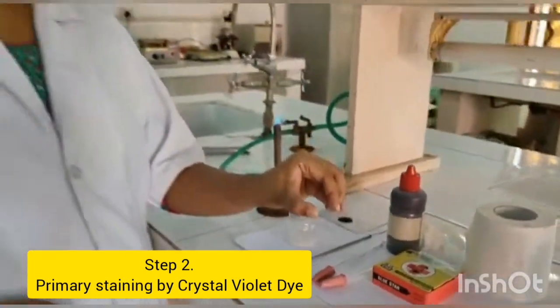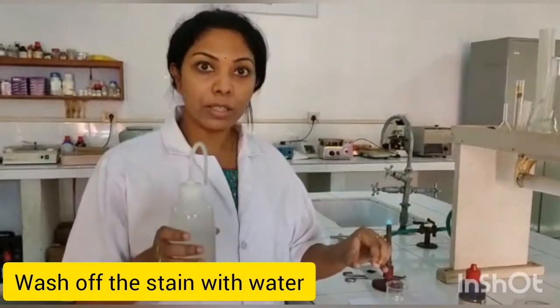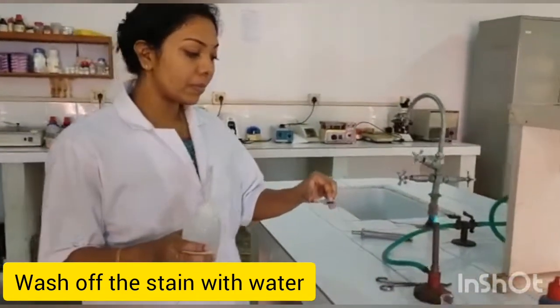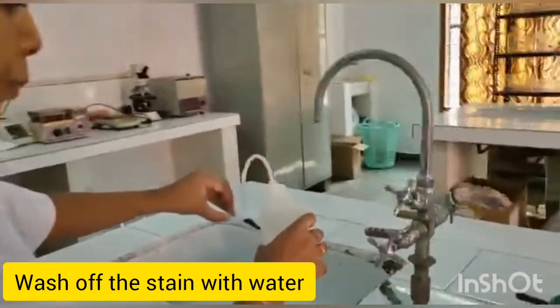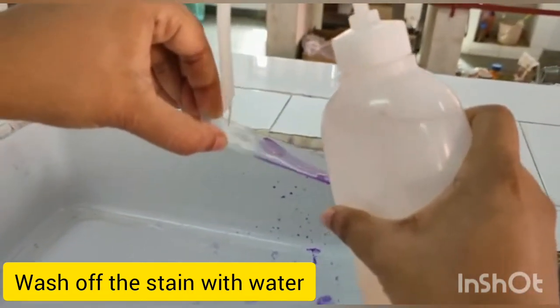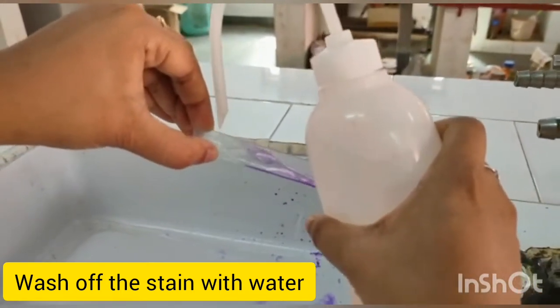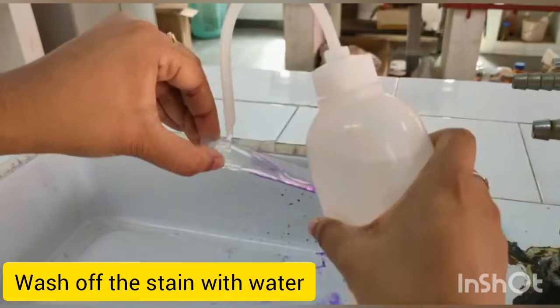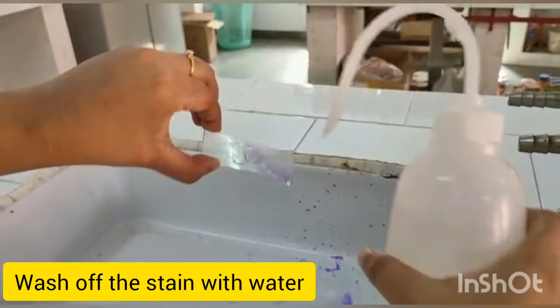Once it's done, we have to wash it off with tap water or distilled water. After the 1 minute is over, we wash it with tap water. You have to make sure that you don't wash off the smear, and you have to apply the water very gently over the smear so that the violet color will be washed out. Now we have washed the smear with water.